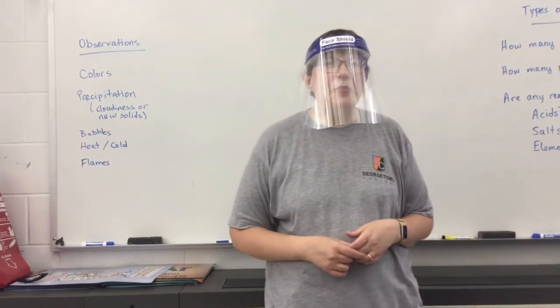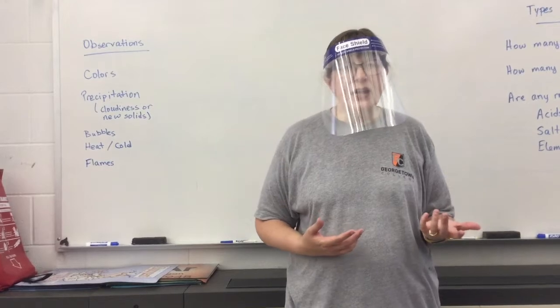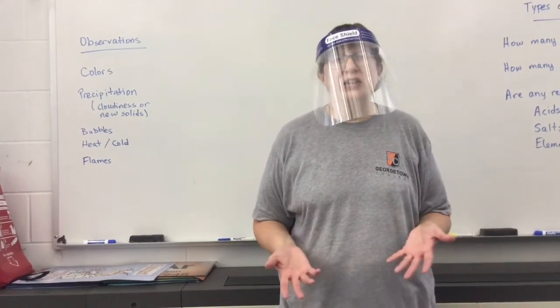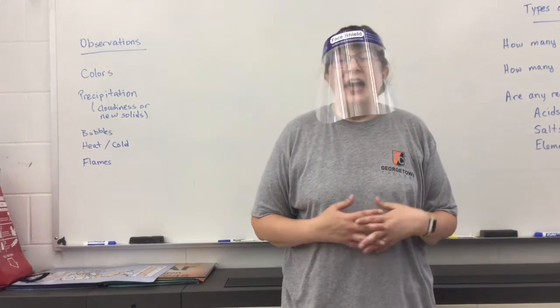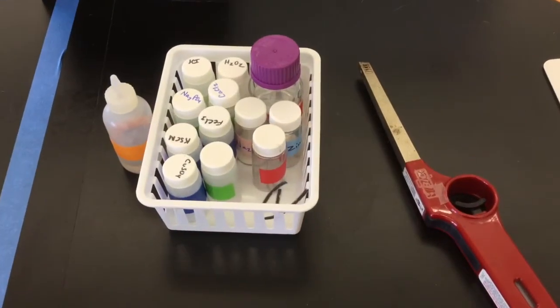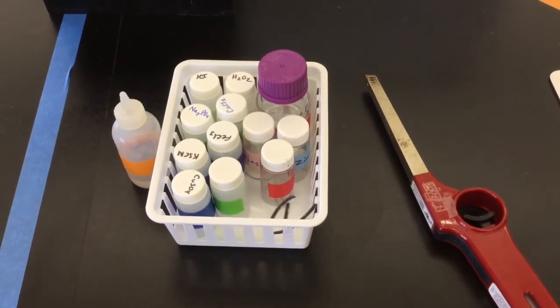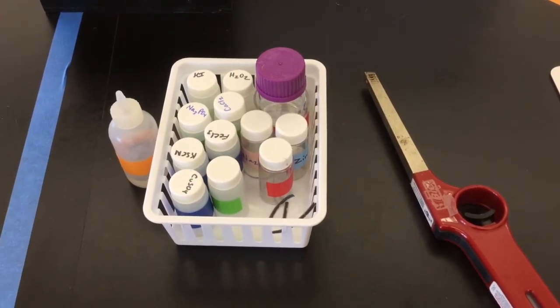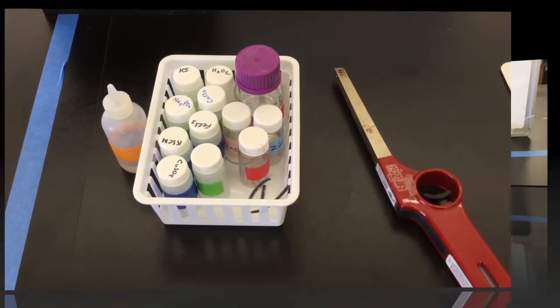And finally, there will be one experiment in which you'll be paying attention to the flame. And again, with the flame, you're going to be paying attention to the color of the flame. Make sure to note all of these things in your notebook as you proceed. For this week's lab, you will receive all of your materials in a basket, and you will also receive a lighter. The materials may be labeled on the top or on the side.